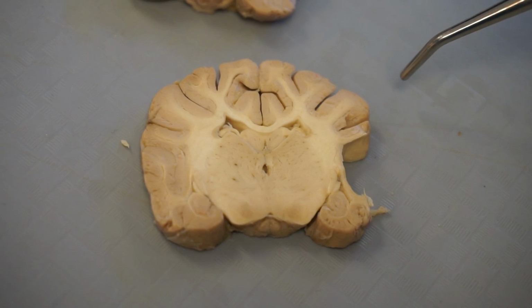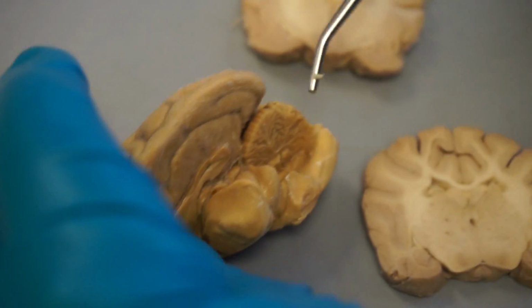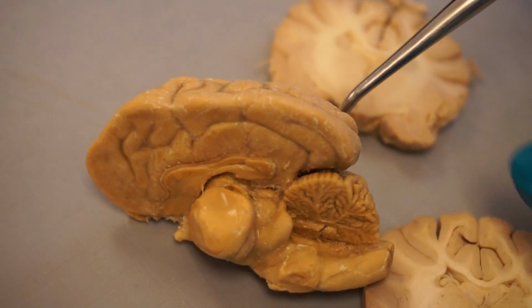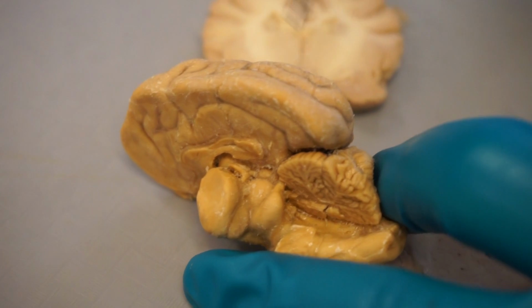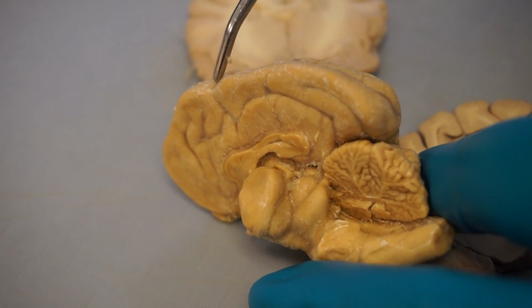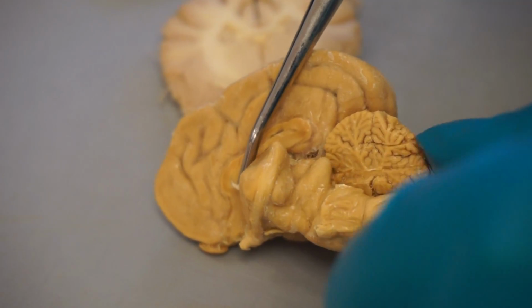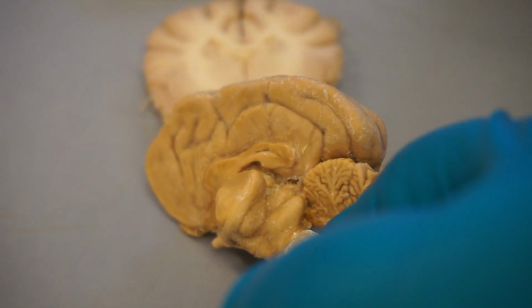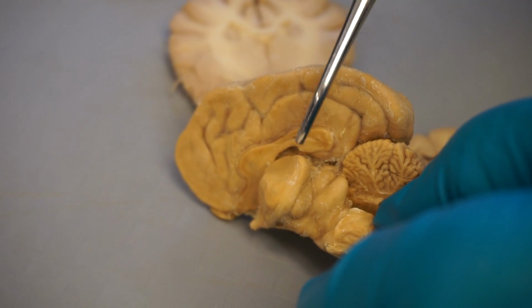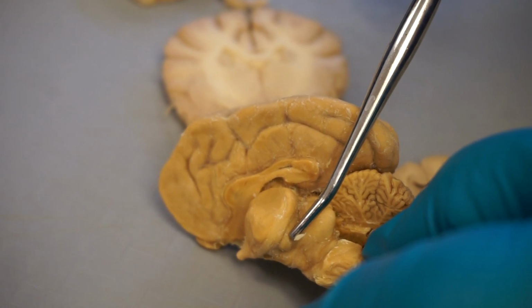I do want to point out that the diencephalon goes quite a bit farther into the mesencephalon. Can you see that pretty well? Okay. If you look at this hemisected brain, where that optic tract ends, that would be our lateral geniculate and medial geniculate.